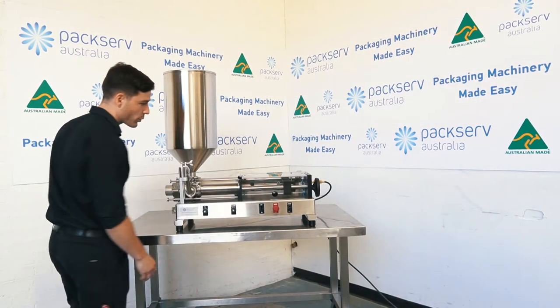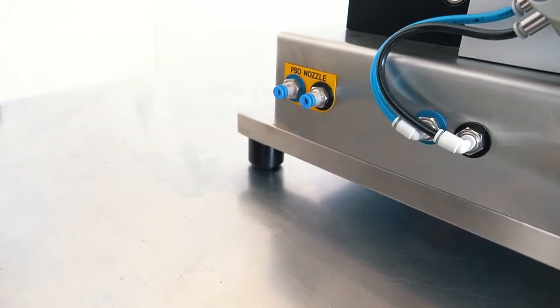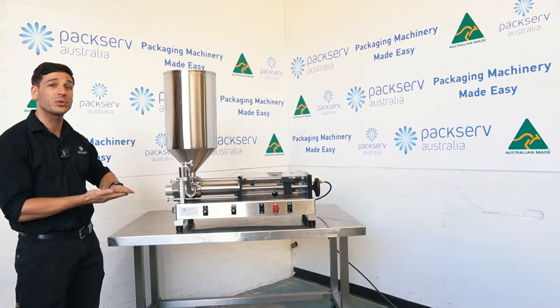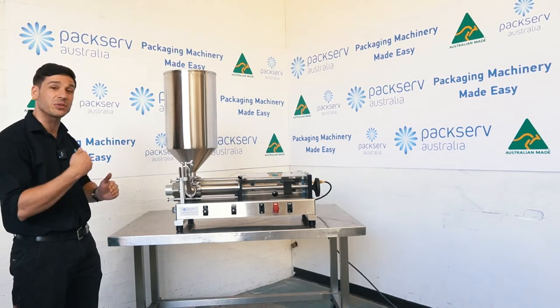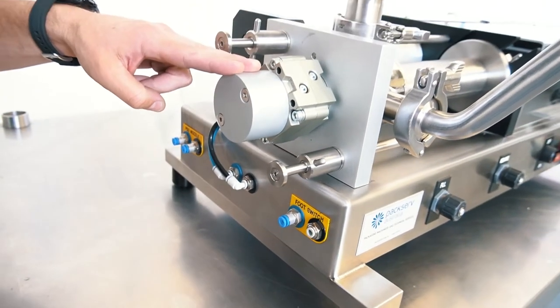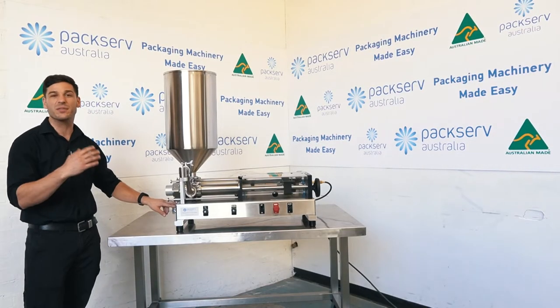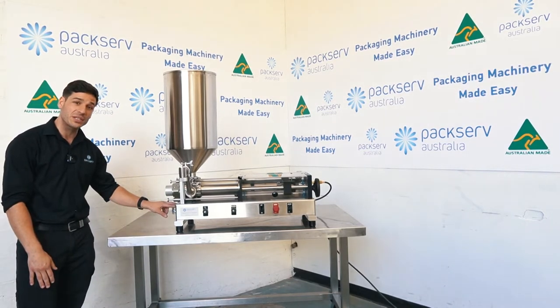I'm going to run through all the ports and what everything does. At the very back left of the machine, we have these two ports here. This is the PSO nozzle, or positive shutoff nozzle. This is used when you have a nozzle that actually closes itself off to prevent any excess leaking in between fills and any drips going around your product. The middle ports are for the valve. Generally we'll be running a rotary valve for this machine. There are instances where you might have a spool valve if you're doing a hot fill, which is above 60 or 65 degrees, but that's always going to be placed in the same two centre ports.